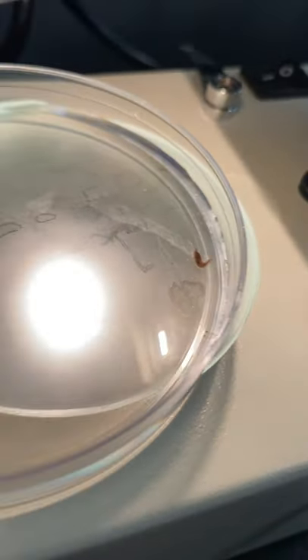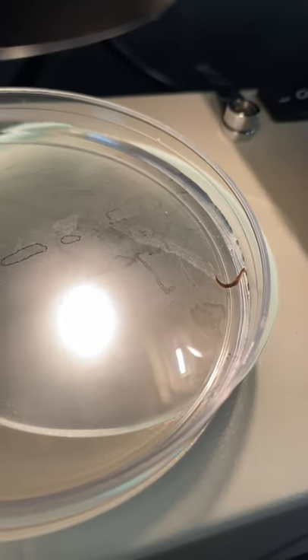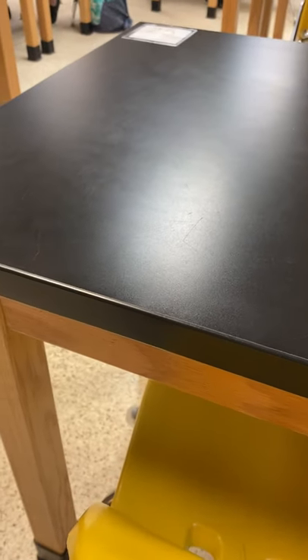When they cut them, they use a cover slip to cut him in half. They did two worms just in case one died. For day zero observations after cutting: students noted the head was swimming around but the tail was laying on its side. After cutting, the head is growing, the tail is still moving, but no new growth was noticed yet.